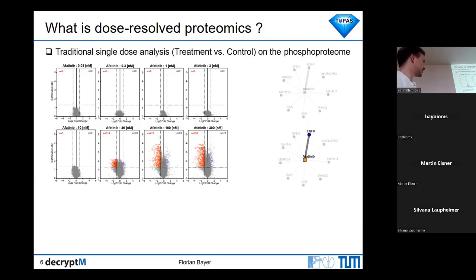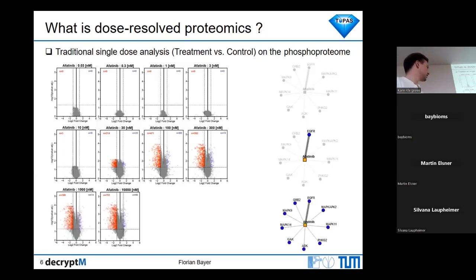What's also interesting is that we know the affinity of afatinib to EGFR, and it is in fact 10 nanomolar. So at 10 nanomolar nothing is happening yet in the cell, but these effects you can really attribute to EGFR signaling. However, if you continue further, to 1 micromolar or 10 micromolar, you have the problem that afatinib starts to hit different protein kinases, and then you get more phosphosites regulated. If you just had this picture, you wouldn't be able to differentiate the signaling that is driving this cancer from other kinases. Your drug would just interfere.